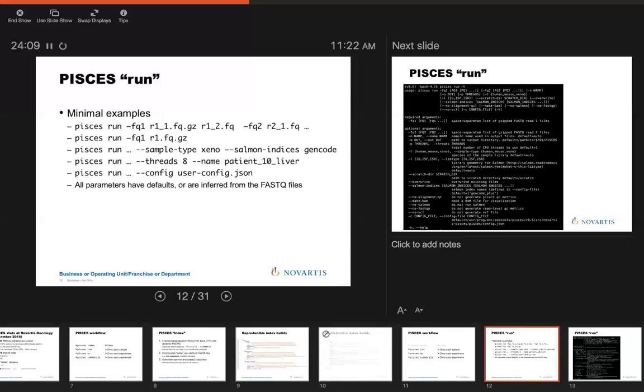My observation is that the xenografts are usually between 95% human and 95% mouse. In cases where you have substantial ribosomal RNA contamination, could that impact your apparent species attribution? No, because I'm not using ribosomal sequence for this. I'm using beta-actin. It's a special case where I'm doing my own K-mer counting, only grabbing beta-actin sequences and then generating a best guess.